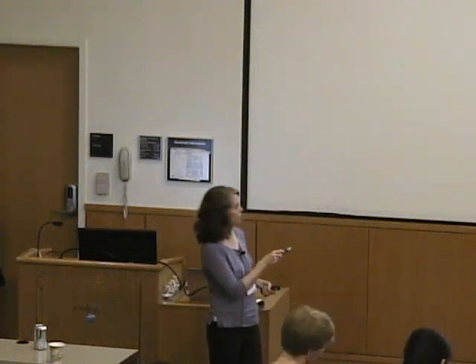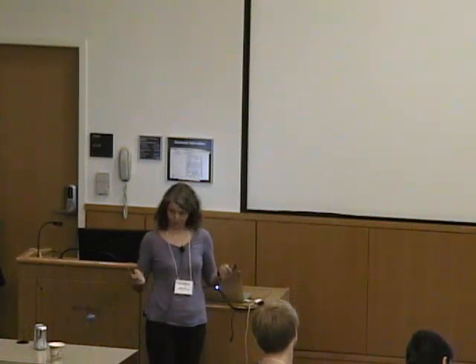This is getting to be a kind of large system for NMR. This would be a small protein, so cytochrome C would have a rotational correlation time in this range. Small molecules, though, would be down in more like 10 picoseconds or something. So that's a different situation, but I'm going to assume proteins here. And the electron spin relaxation time falls in this range, but once you get to really long electron spin relaxation times, you get the extreme line broadening, and that becomes more difficult to work with. So the systems we do the most NMR on have electron spin relaxation times in this range.